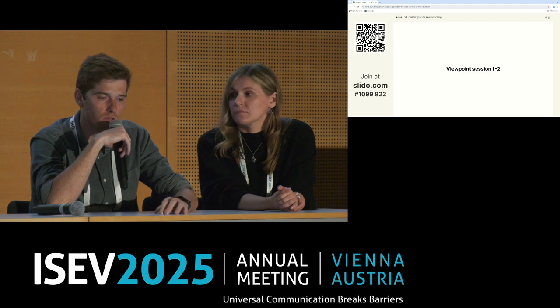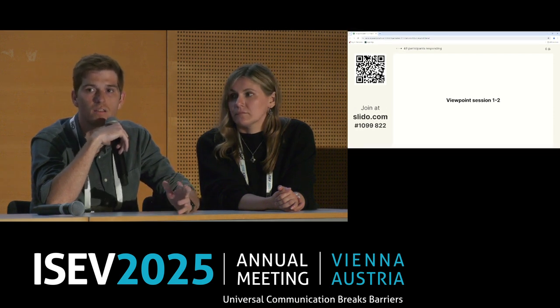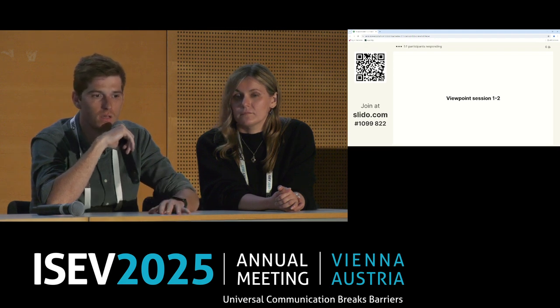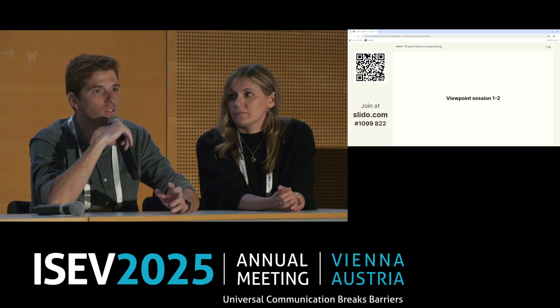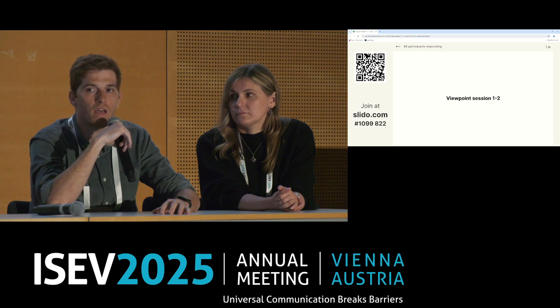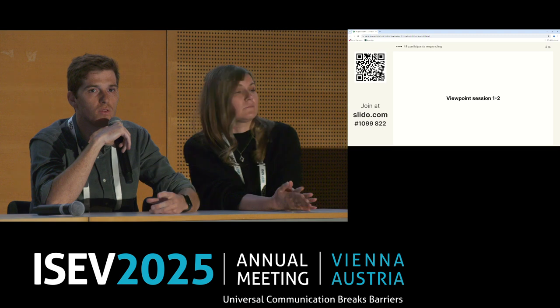in order to be able to actually study your vesicles. And step number 3 is to understand that indeed there is no one key that fits all methods. There are pros and cons for each of the methods that you will try to use. With regards to that, the key is understanding what these pros and cons actually are, and based on your informed decision, you will then be able to select.